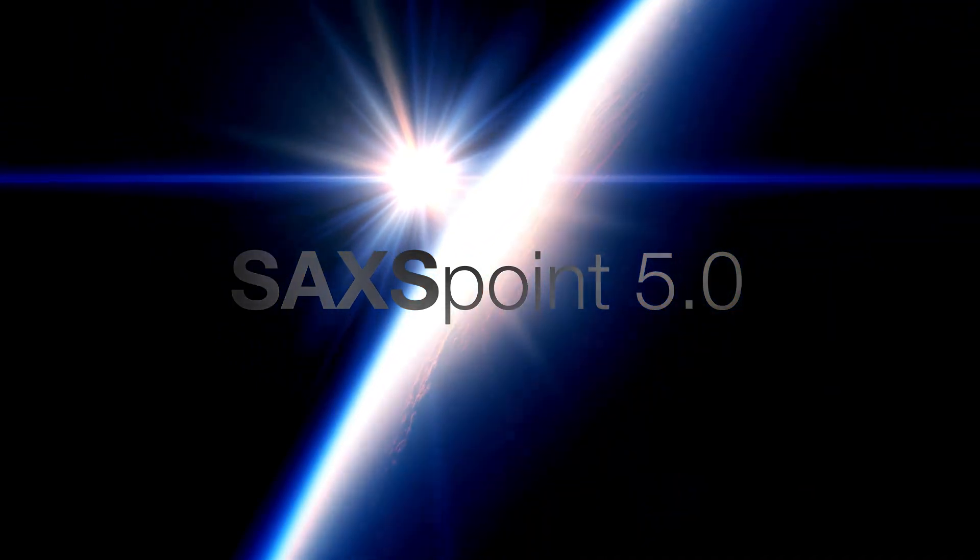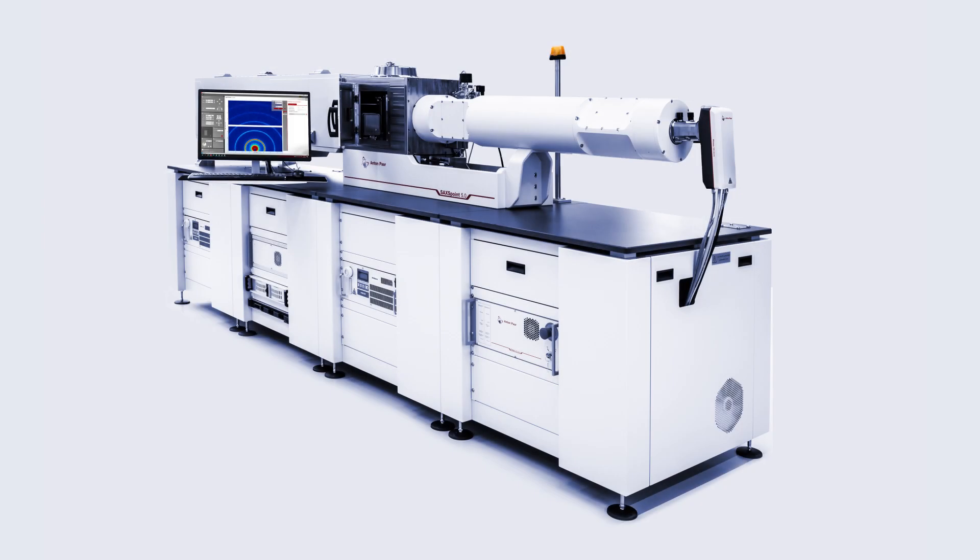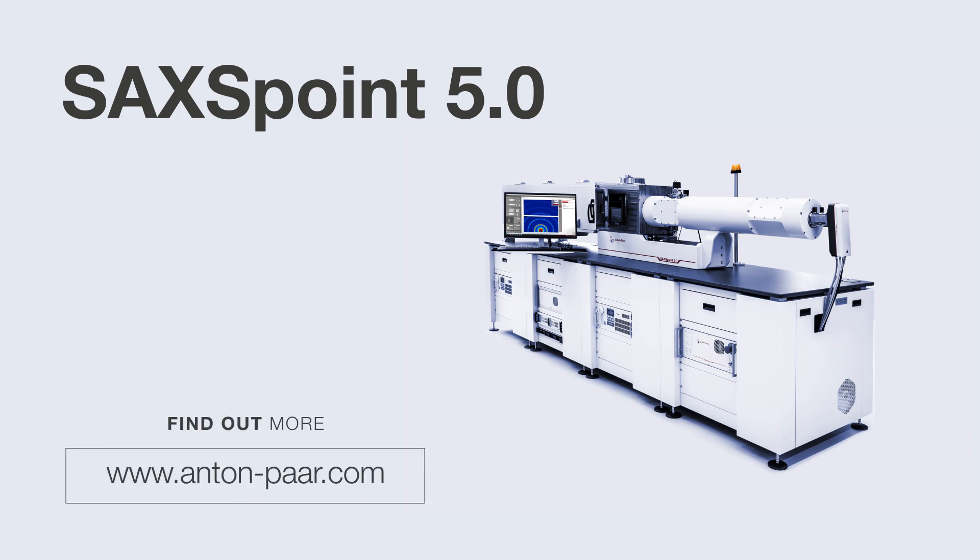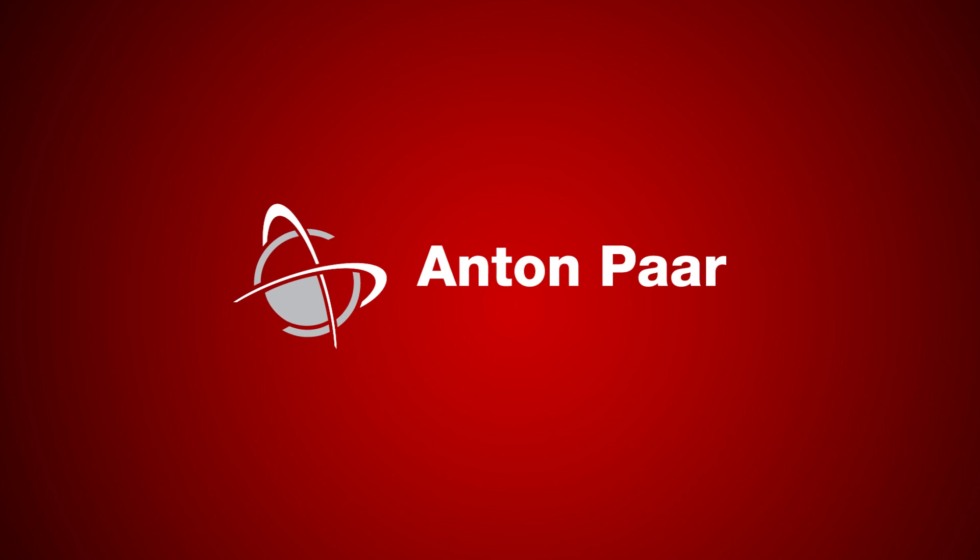SAXSpoint 5.0. Driving the power to experiment. When something is in your DNA, you can just feel it.